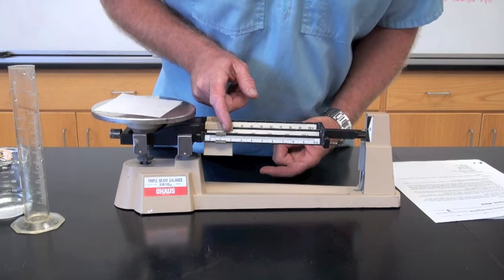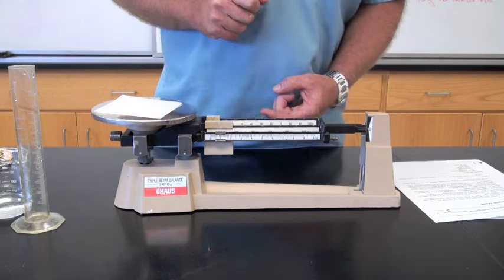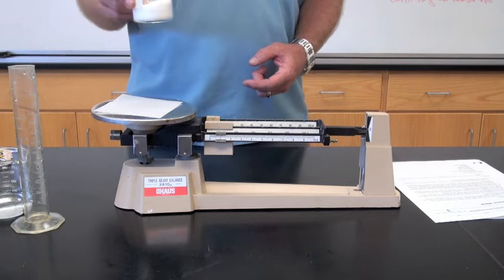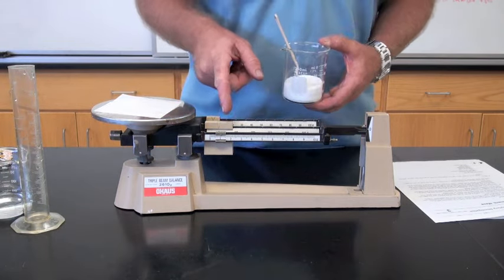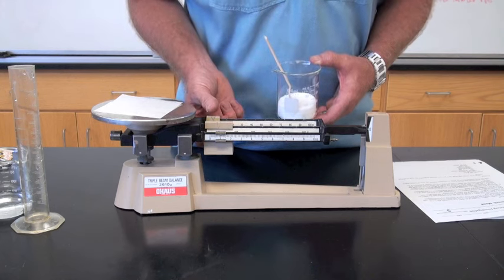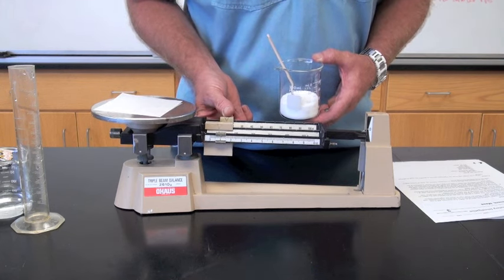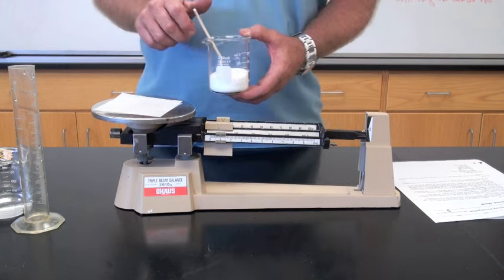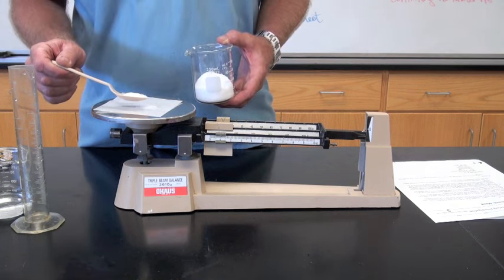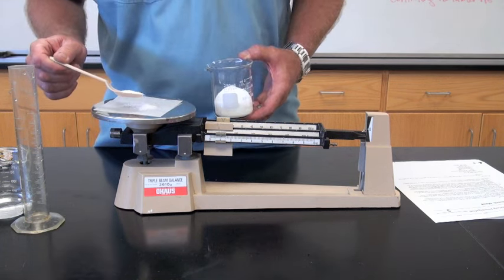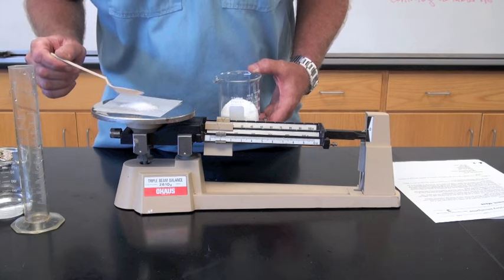Once you have the mass of your paper zeroed out, then you can start adding your substance. If you need 10 grams of your chemical, then you'll add 10 grams to the mass of your paper. So I add my 10 grams by sliding my 10 rider over. Add my chemical slowly until my zero marker equals its zero.